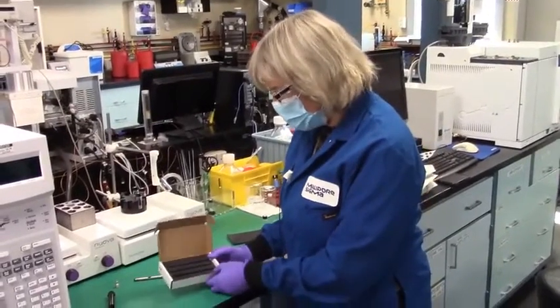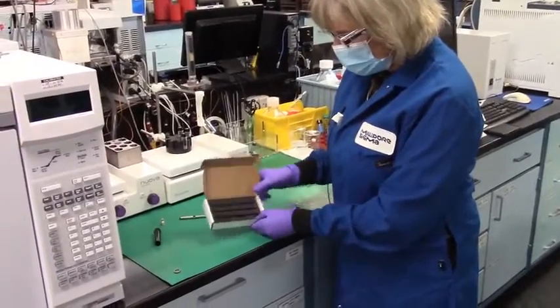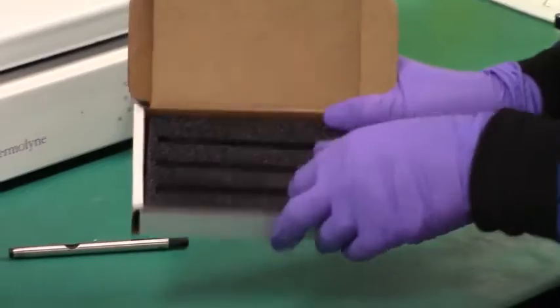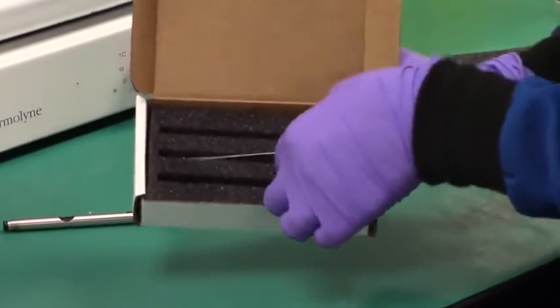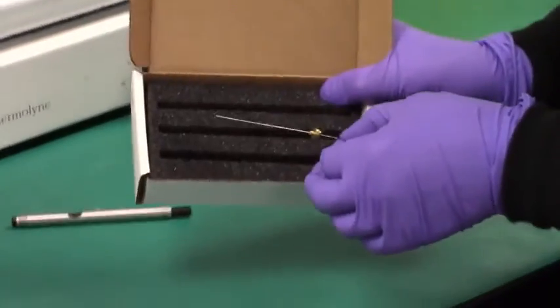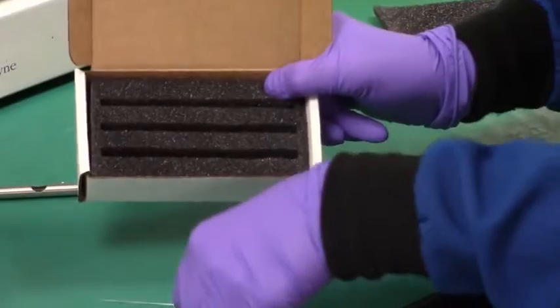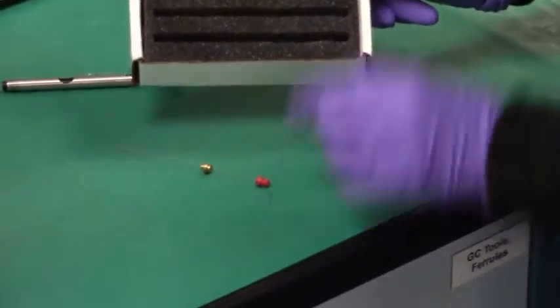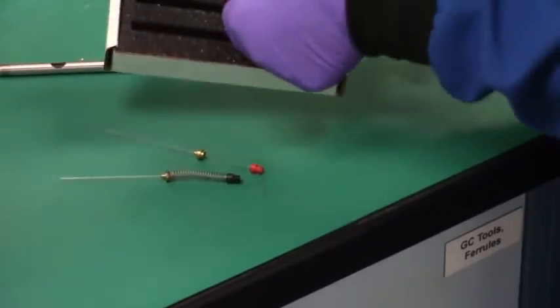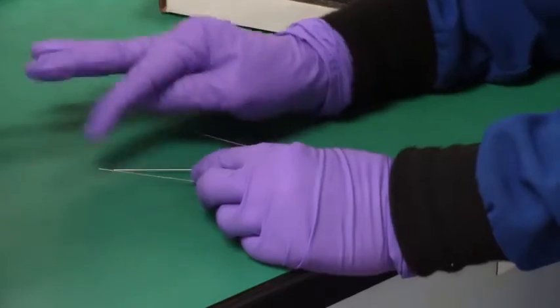Okay, so the heart of the device are the fibers, the SPME fibers, and I've got 3 different types here, and by types I mean that they're coated with different materials. It can be a polymeric coating or a particle coating. Now when you buy SPME fibers, to know which kind you have, of course it'll be written on the box, but once you take them out of the box, they should have different colored hubs. Like here I've got black for carboxen, red for PDMS, and then blue for divinylbenzene. And that denotes what kind of coating you have.